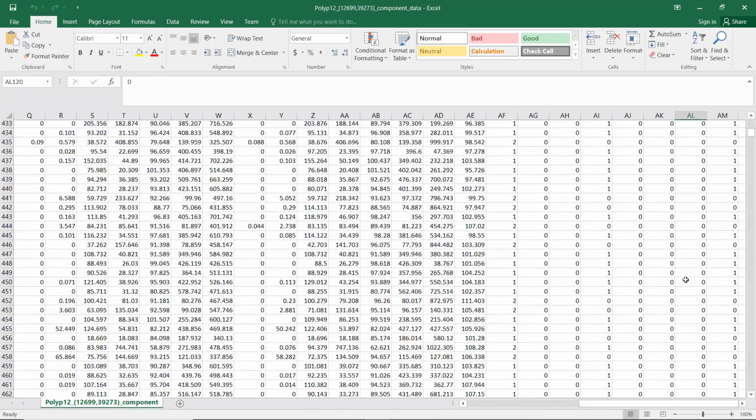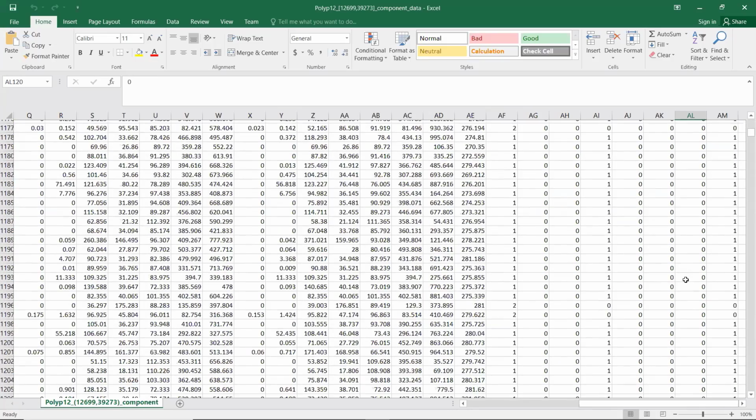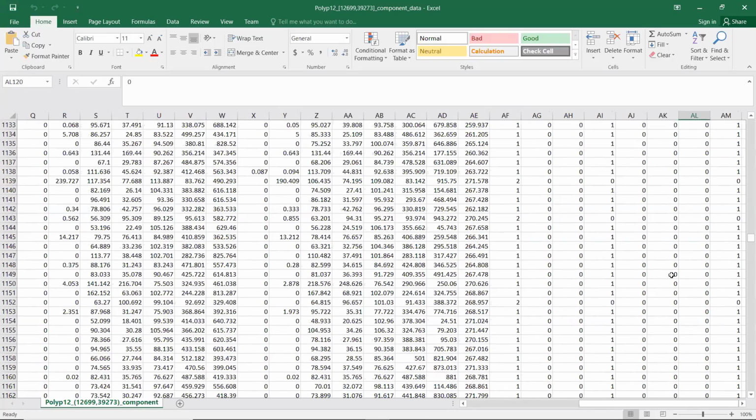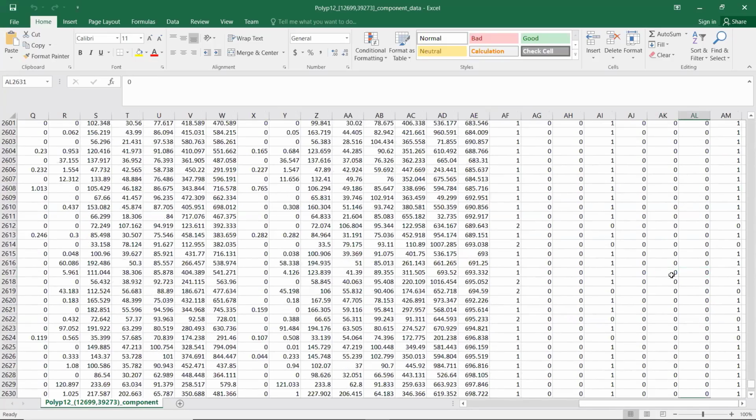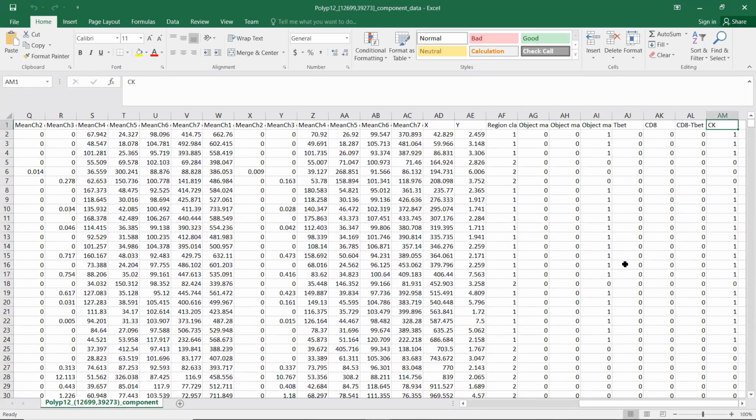We don't have lots of CD8. I saw one. Well, you get the idea. So you have all your markers defined like this, and so you have not only the markers that were identified, but also the combination of markers, which might be very helpful to do the post-processing analysis.